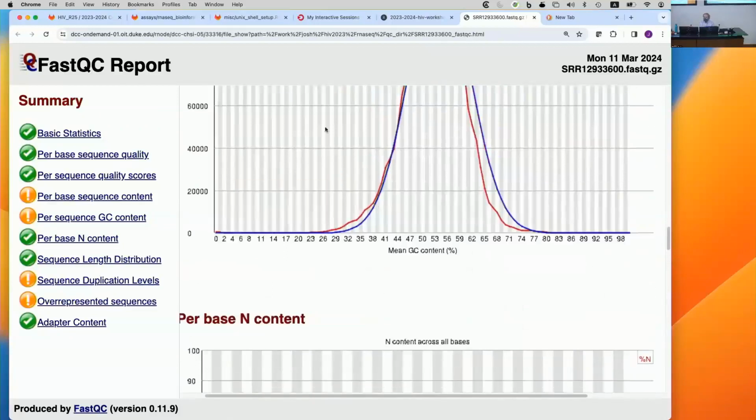I should say, in general, for the QC, for most of the information, we're looking at it and we're going to say you can't really do anything with the information. There are two things you can do with it, which I'll tell you in a sec. The other one is you can look at it and say, this data is a pile of crap. I gave high quality samples to the company sequencing, and they give me crappy data. And I'm going to ask them to run it again or give me a refund. That's the big thing you can do with this data.